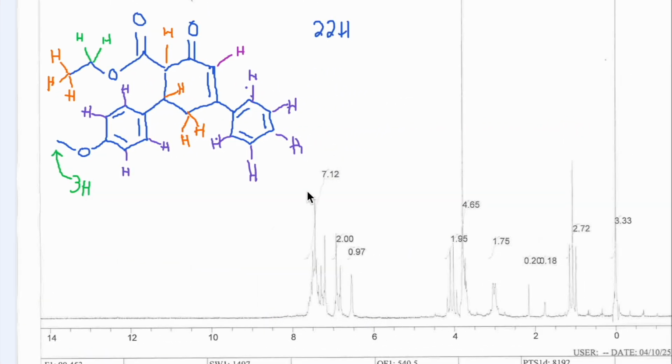All right, I wanted to try to record a quick video about the NMR for this week's product. It is pretty involved. There are 22 protons, 22 hydrogens in this molecule, so that's quite a bit. We've worked our way up to the most complex NMR yet. I have a sample printout here from the 90 megahertz machine. The 60 megahertz was similar.